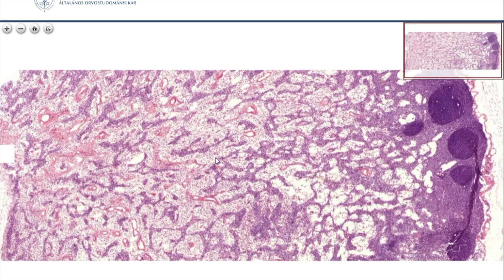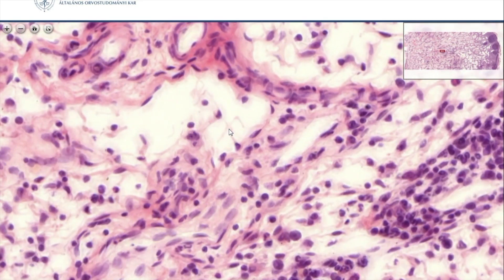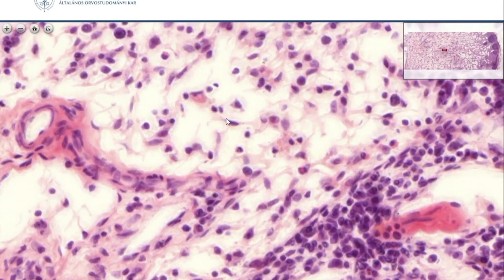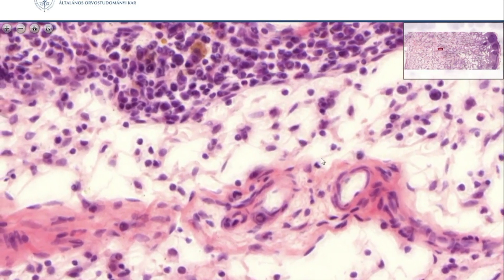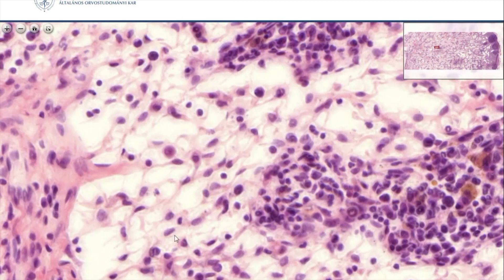Reticulum cells — we will see them in the medulla territory of the lymph node. Let's enlarge it. Here you see these cells with multiple processes. The processes get in contact with each other, and with this a meshwork is formed, like here for example. Occasionally you also see lymphocytes — just small round nuclei belong to lymphocytes.